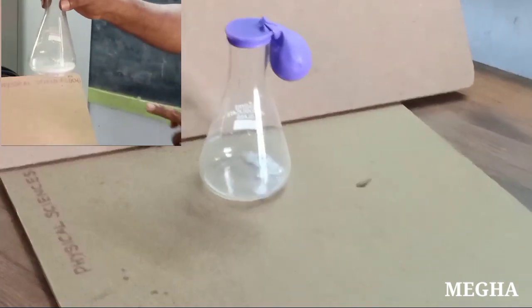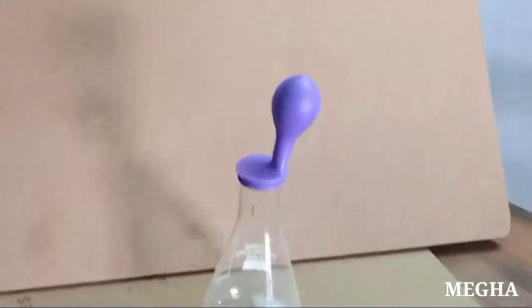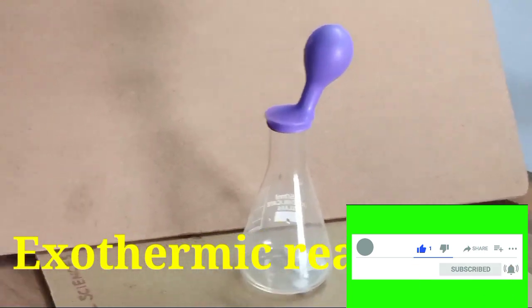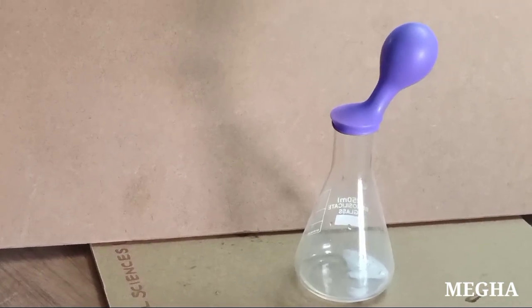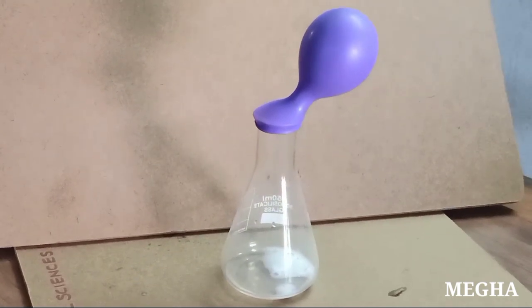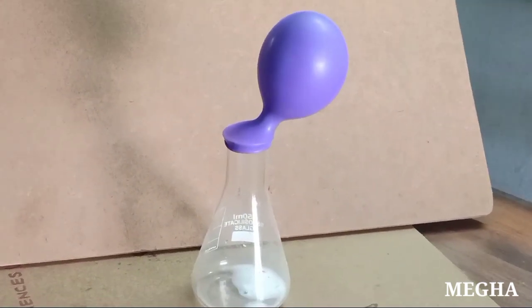Touch the bottom of the conical flask with your fingers. What do you notice? It is hot. Why? Because it is an exothermic reaction. In this chemical reaction, heat is released. Now observe the size of the balloon. Slowly it increases.